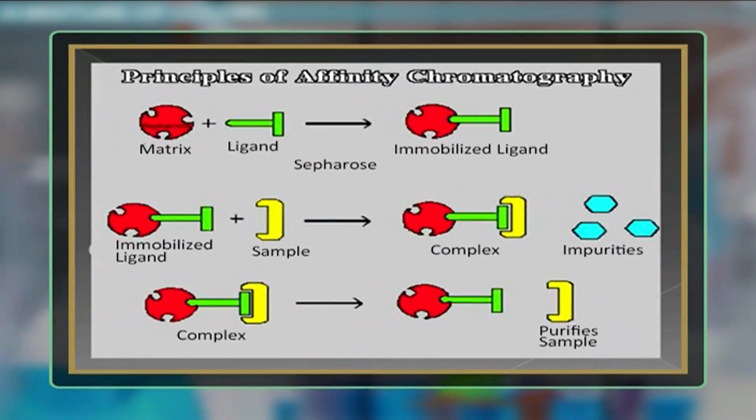The other molecules in the mobile phase will not become trapped as they don't possess this property. The stationary phase can then be removed from the mixture, washed, and the target molecule released from the entrapment in a process known as elution. Possibly the most common use of affinity chromatography is for the purification of recombinant proteins.